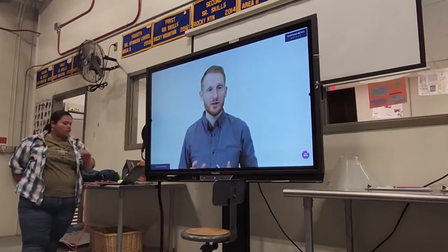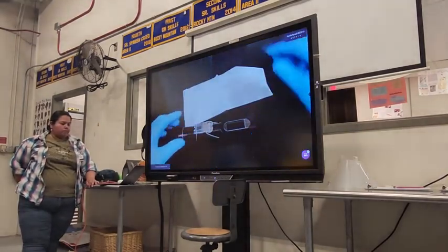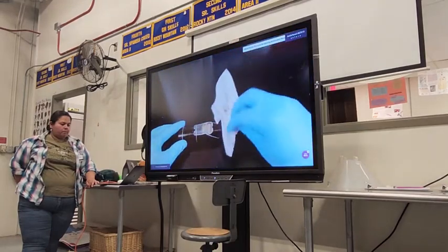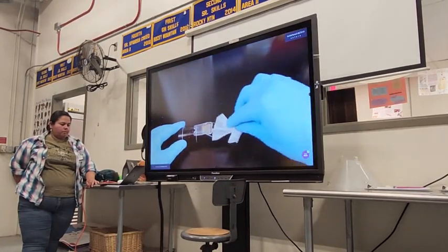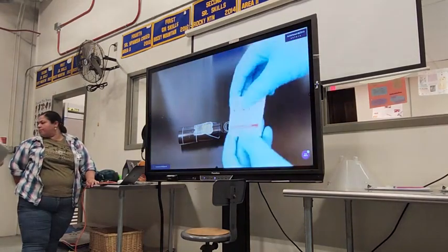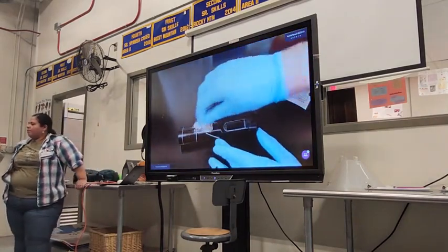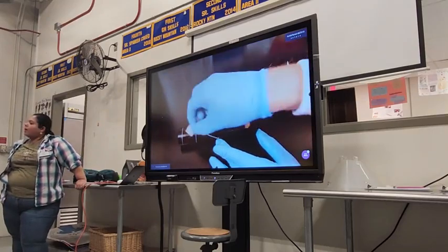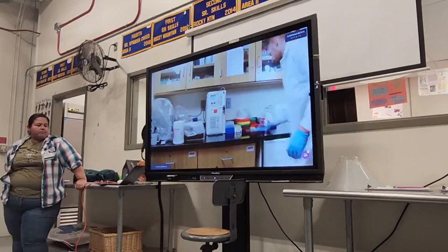Once you finish the measurement and you've written down your value, you can open the top of the refractometer, take some sort of tissue like a Kimwipe, something that's not going to leave any dust particles behind because you don't want to affect the next measurement, and soak up all the urine that you put on the device. Once you've done that, you can clean off the device with an alcohol swab and simply wait until the alcohol is completely evaporated before storing the device or trying to use it again. So that's all it takes to clean the device and get it ready for the next time. Be sure to also clean off the countertop underneath wherever you were working in case any urine got spilled.